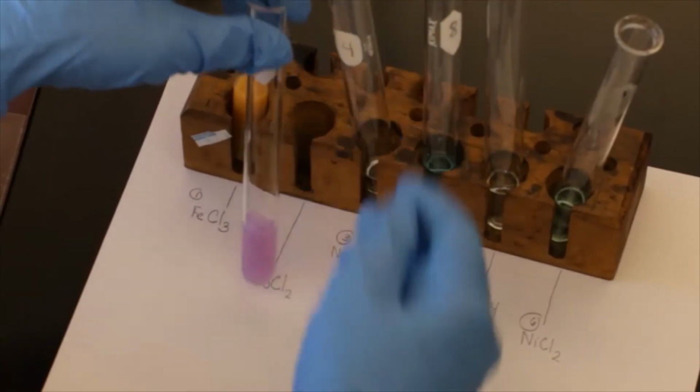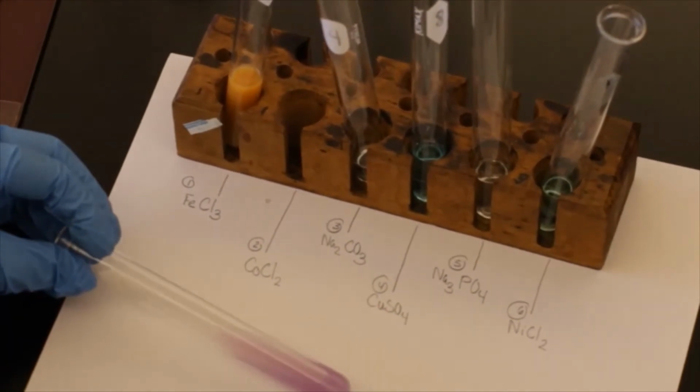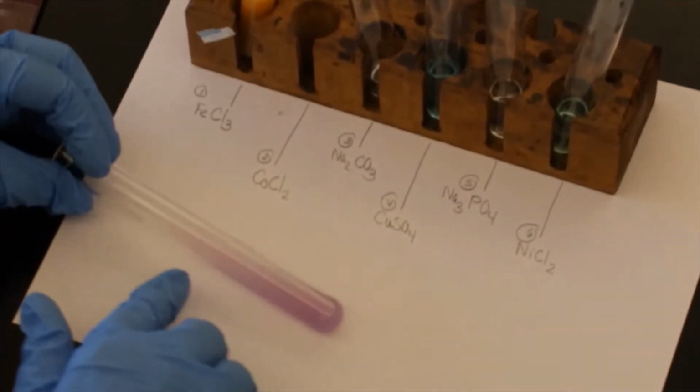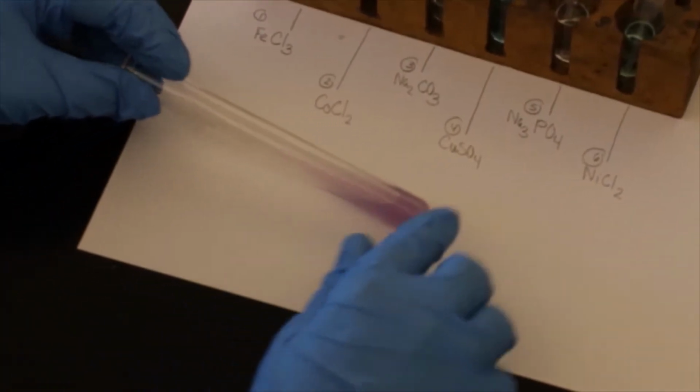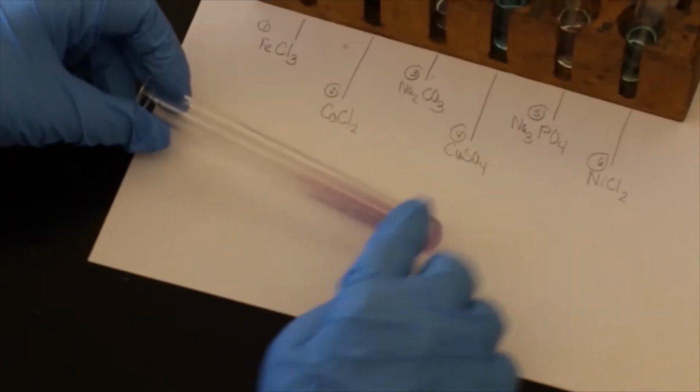We went from pink to a purple. And if you can kind of tell and see, it's a purple solid, all these little pieces of solid. So we have a precipitate coming out, but it's a nice purple color, and it's chunky. Okay. So we went to a really cool purple.